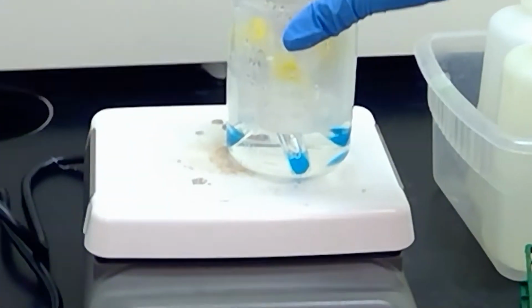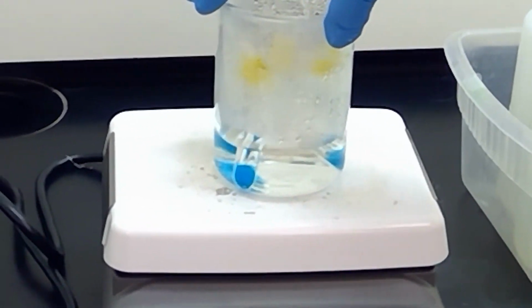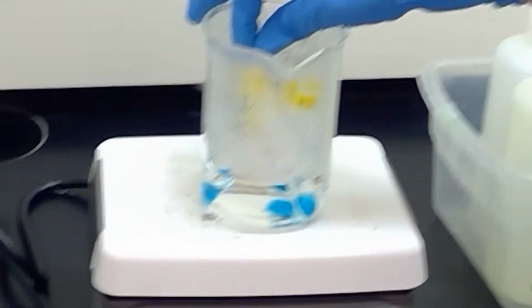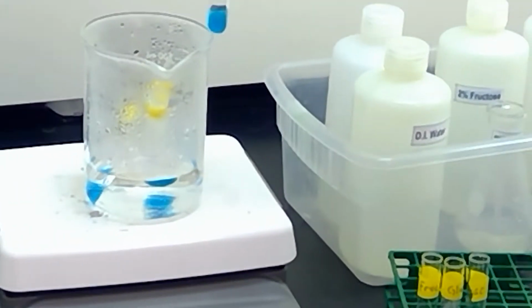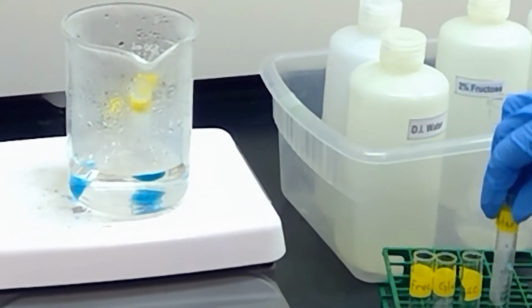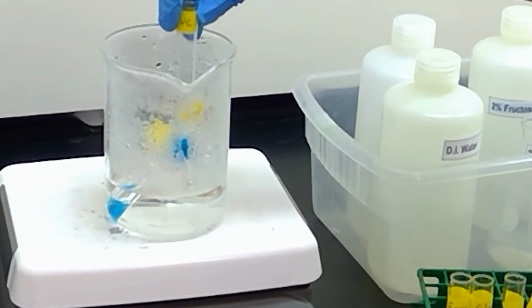All right, and so far these other three are not changing at all. Okay, let's take a look here and see what we have. So we've got starch. Starch is still nice and dark blue. And what is this?